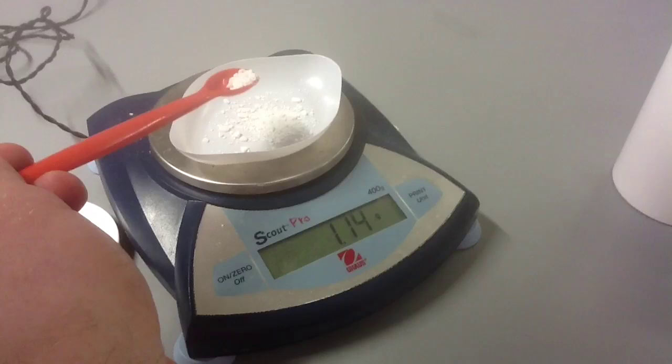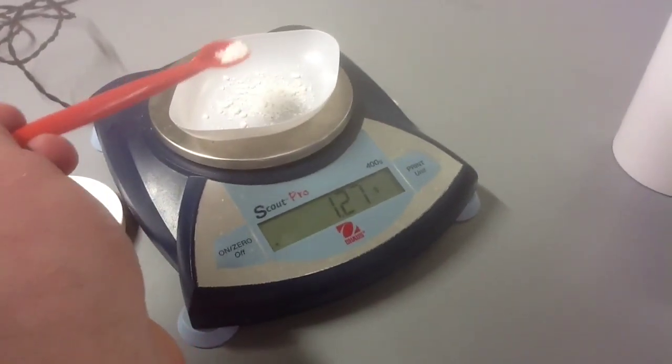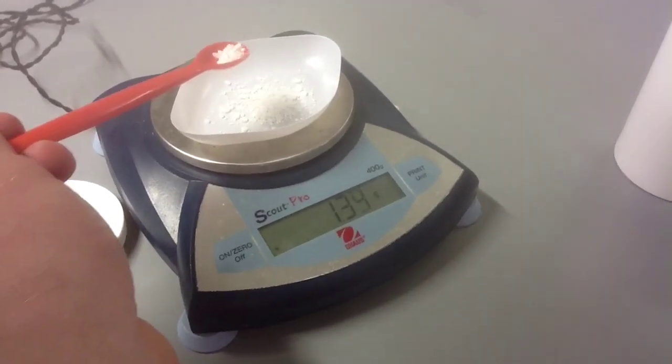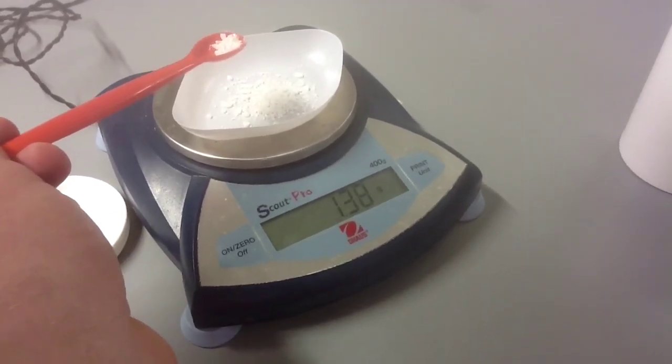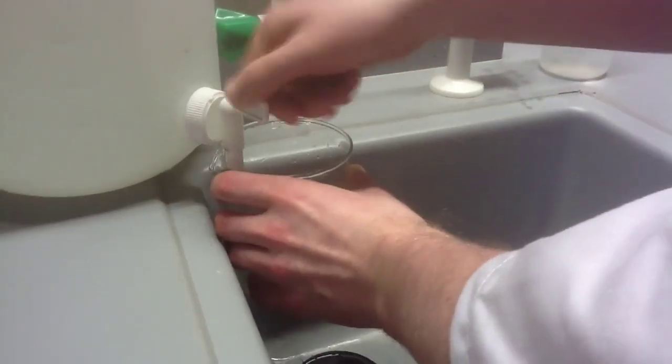Our next step is to get a solution with 1.4% calcium chloride. To do this we will weigh out 1.4 grams of calcium chloride and add it to 100ml of water. Our lab attendant does it again.